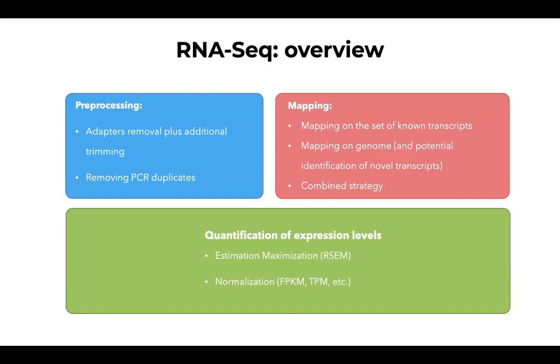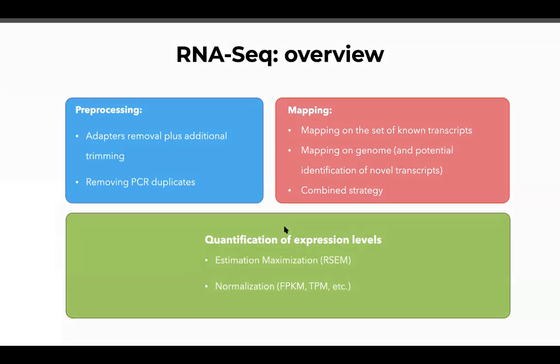So in some sense, it's an inaccurate measurement, but it's an easy measurement for downstream analysis, because the more variation you have at this quantification level, the more variation you're going to find as you start trying to piece this puzzle together to interpret the biological background of whatever you are studying in your samples. Many times, and what we will do in the next several sessions, is assume that genes are a combination of all the transcripts that we have in our data set.